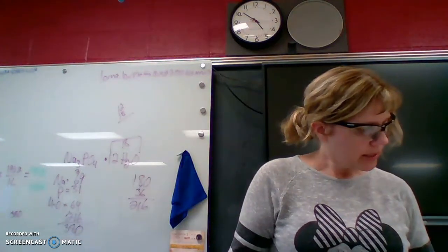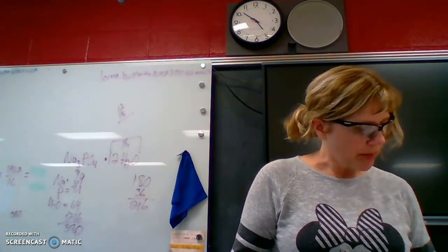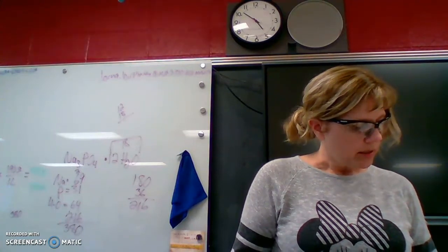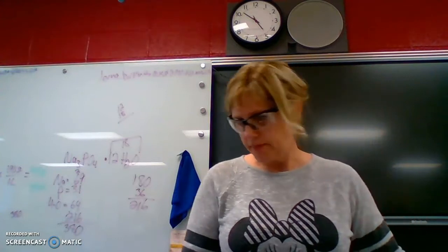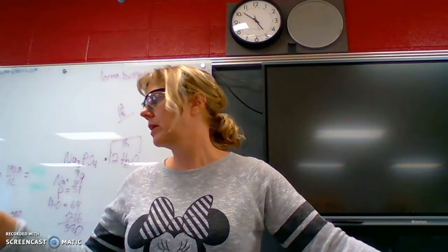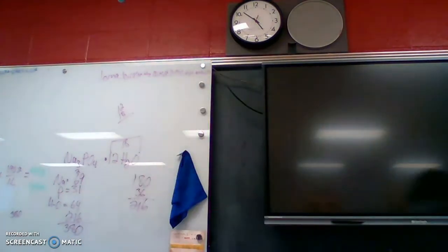All right. Then it says, using a clean barrel type pipette, add one molar hydrochloric acid solution, one drop at a time. One drop at a time. Gosh, I grabbed two clean ones. Oh, I did use them both, maybe.